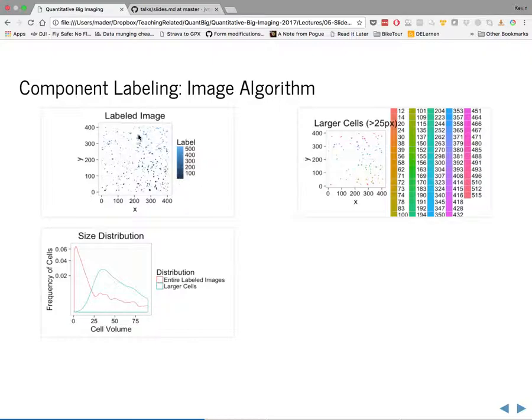And so we can take component labeling on an image. So we have the cell image we were looking at before, and we can perform a component labeling there. Now all of these objects are labeled as different cells, which then allows us to do things. So with erosion and dilation, or these morphological operations, we could use them to get rid of small objects, but it has consequences. Why are erosion and dilation not ideal for getting rid of small objects?